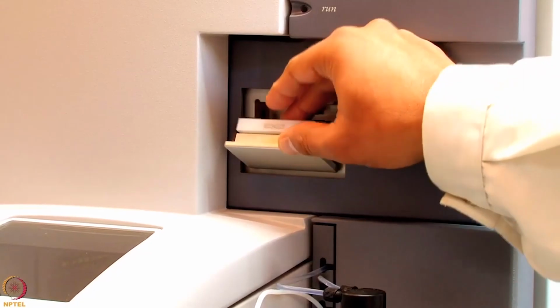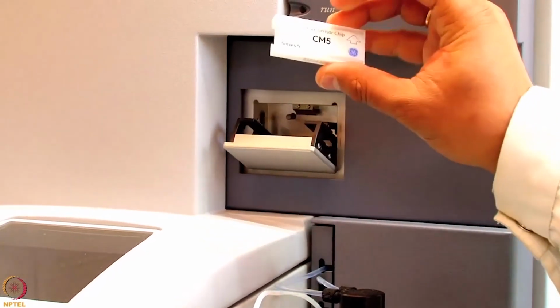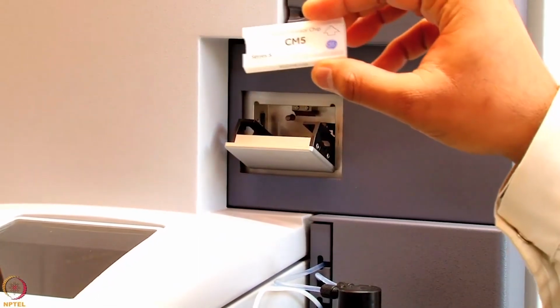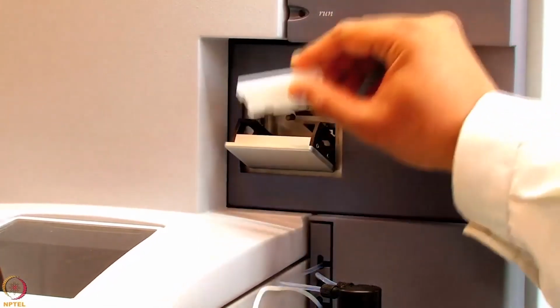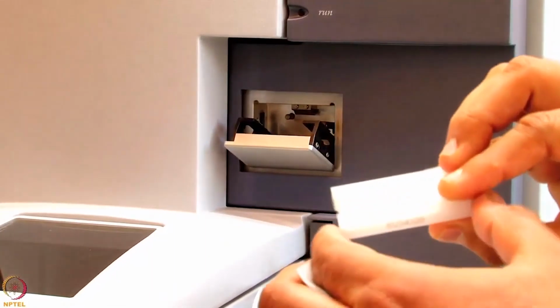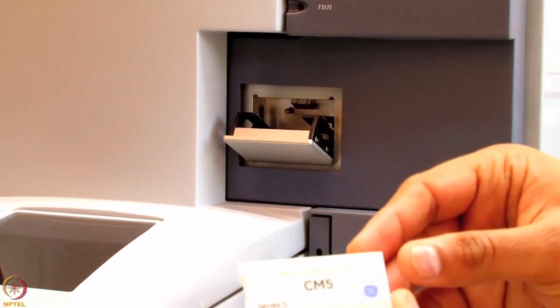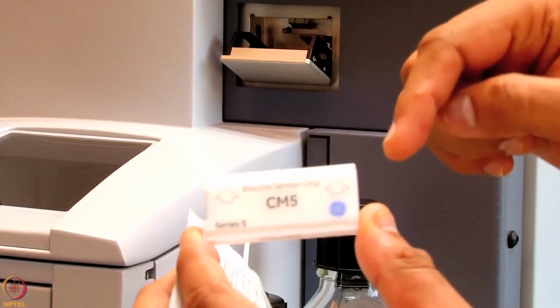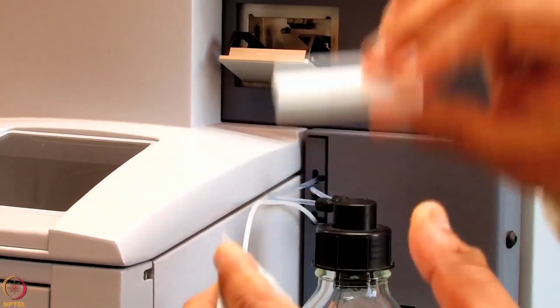So now the old chip will be removed and we will insert a new Biacore CM5 chip here, and the orientation of the chip for insertion is shown on the chip with arrows.